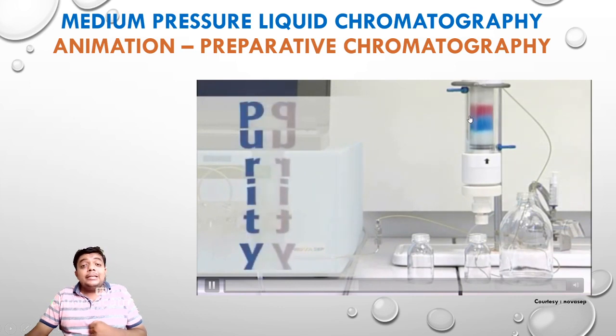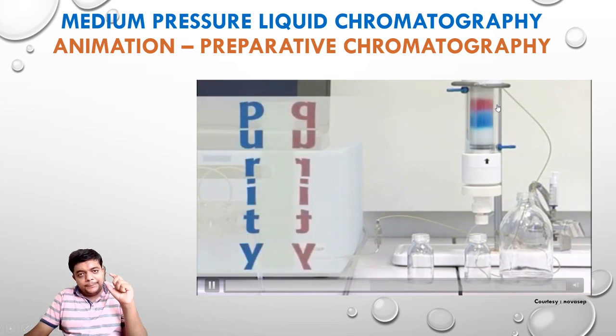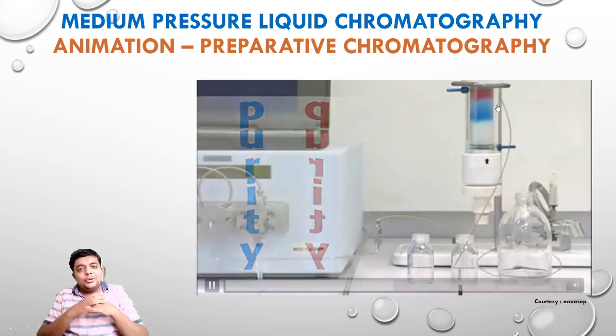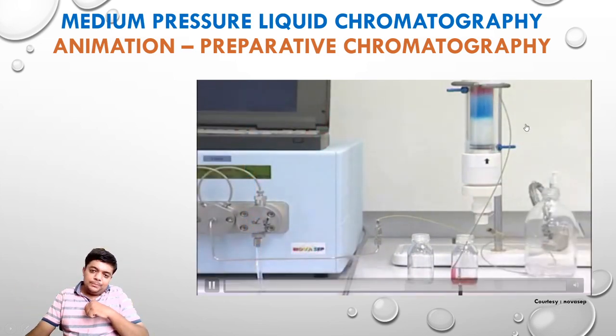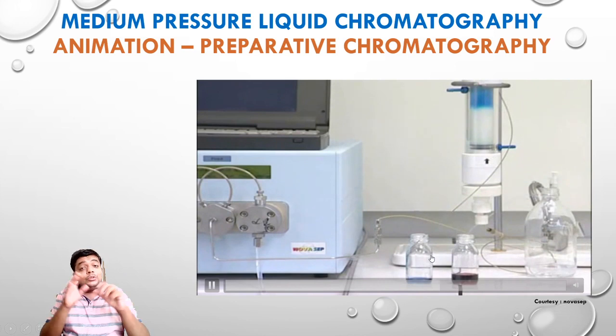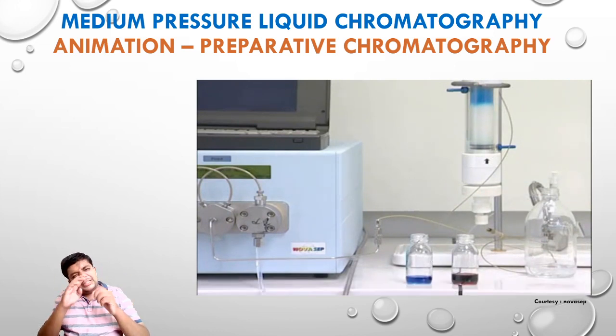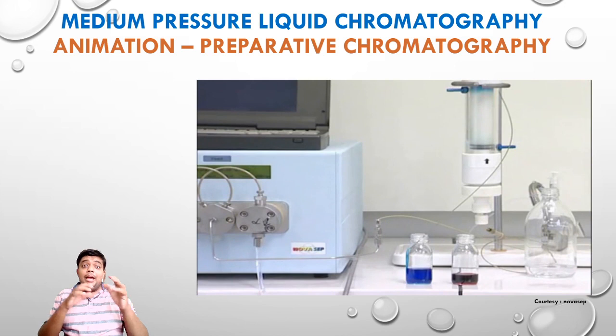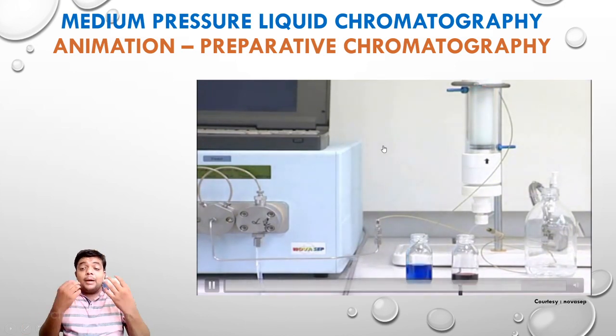But see the quantity, it's a very large quantity. When the quantity is too large, generally we prefer it to be preparative chromatography. You can see the first component getting separated, and now you can see the second component getting separated. So this is where you need separation of the components from a matrix into a really large quantity that can be used for further experimentation, that can be used for further examination.